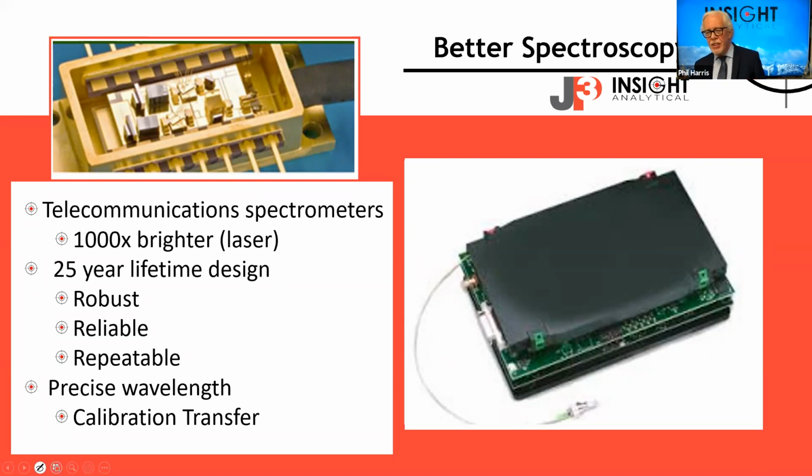So one of the things that JP3 has implemented, I know Timothy's on here from Axon, is, if you like, just a way better spectrometer. Axon had developed this broadly tunable laser spectroscopy for other applications, one of them being looking inside people's eyeballs, optical coherence tomography, medical applications.